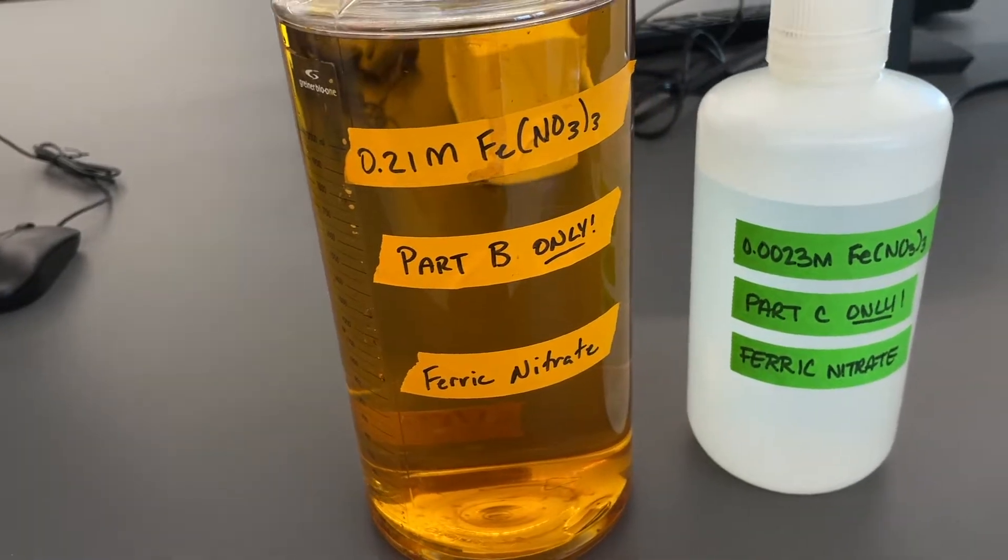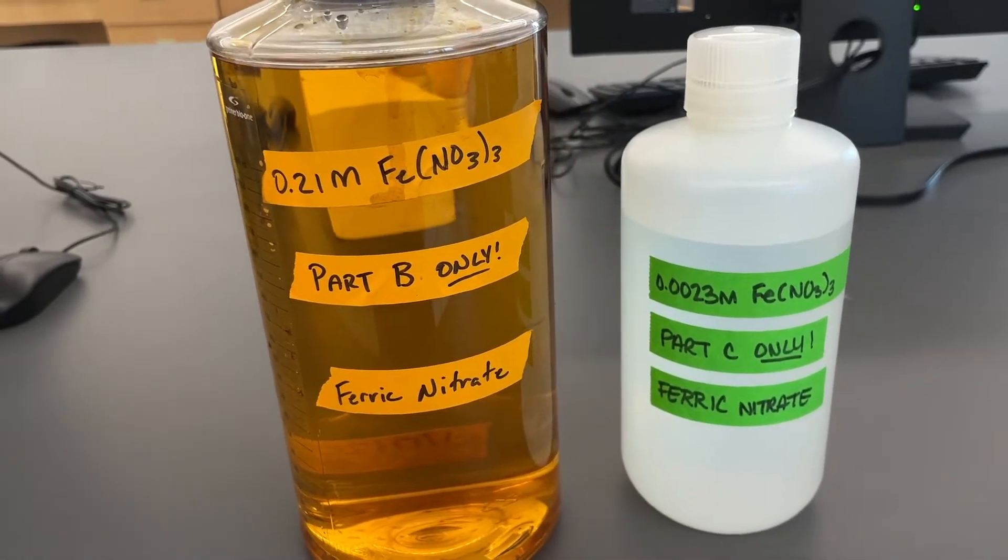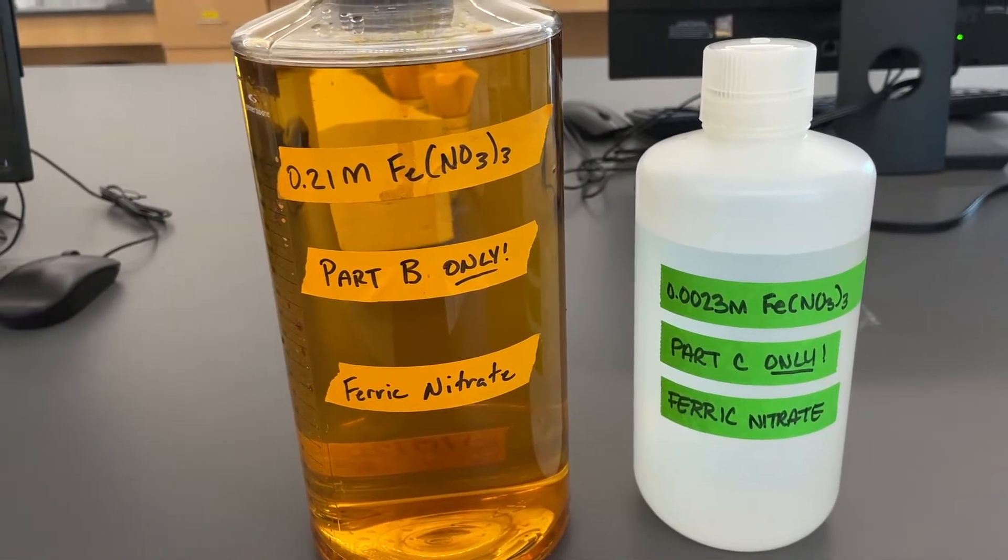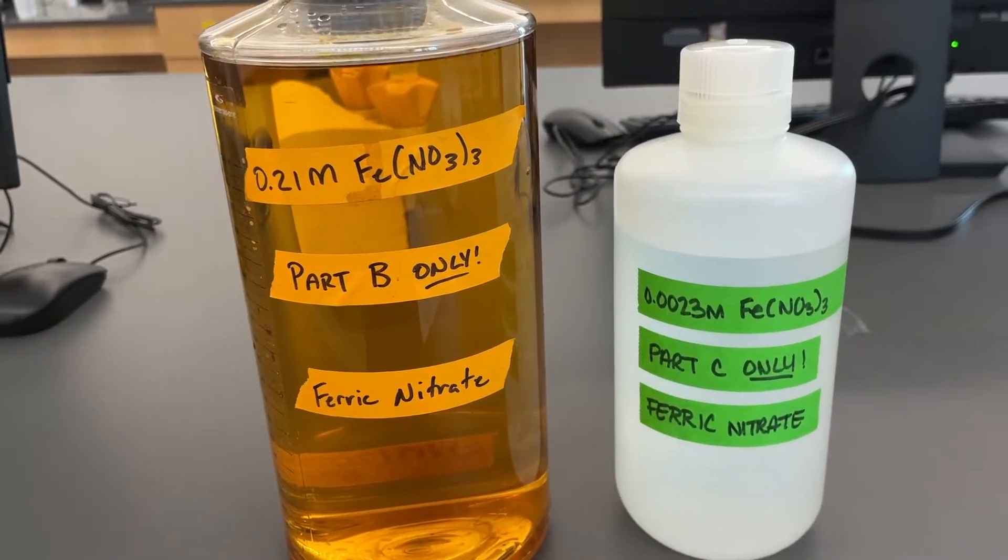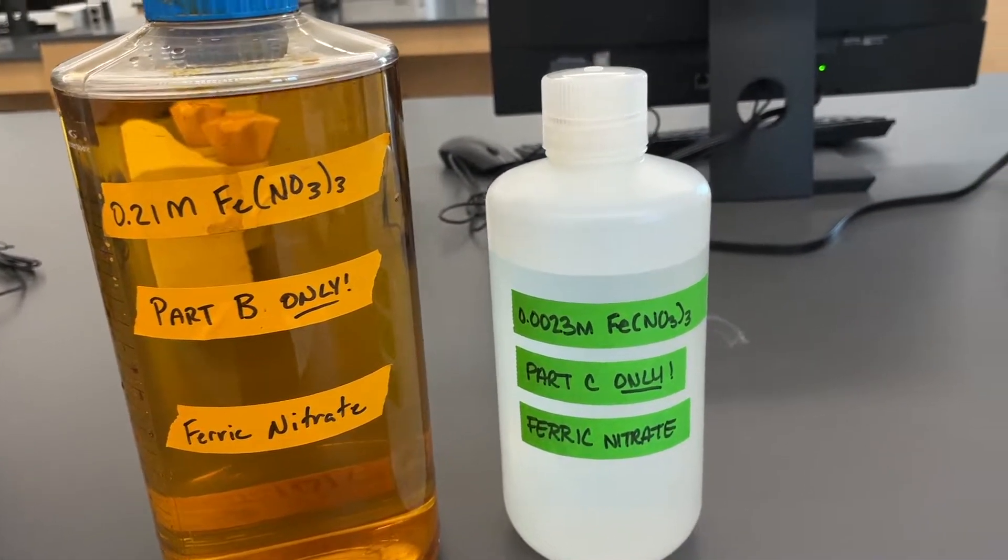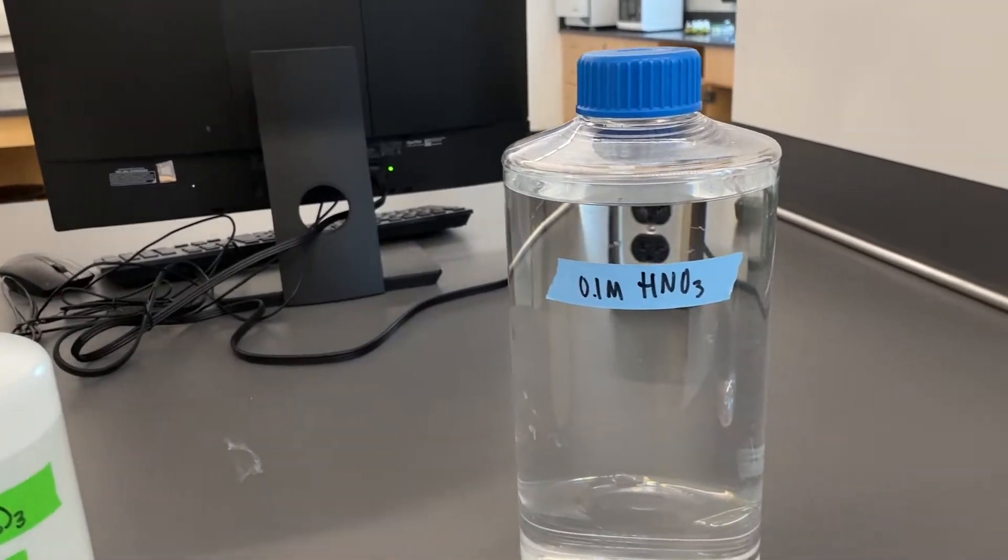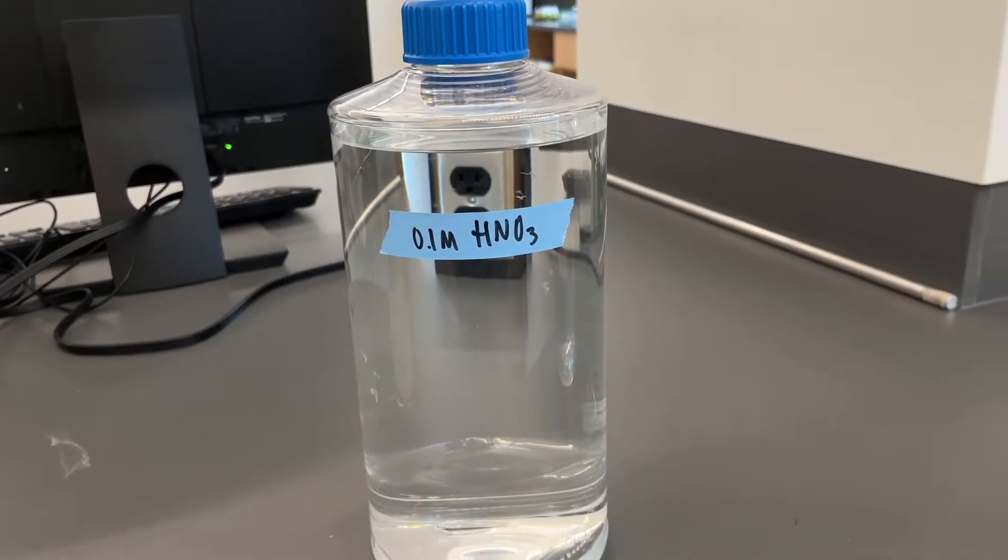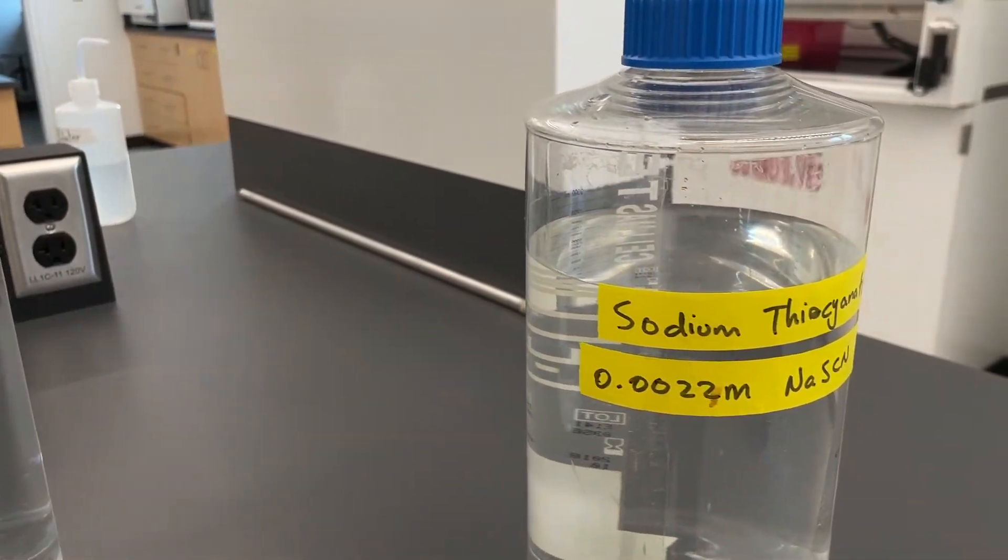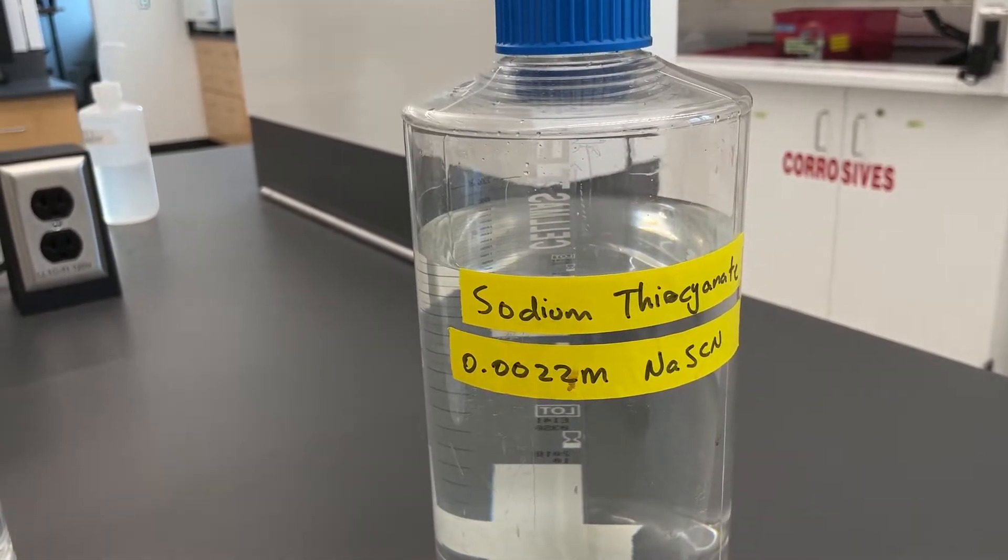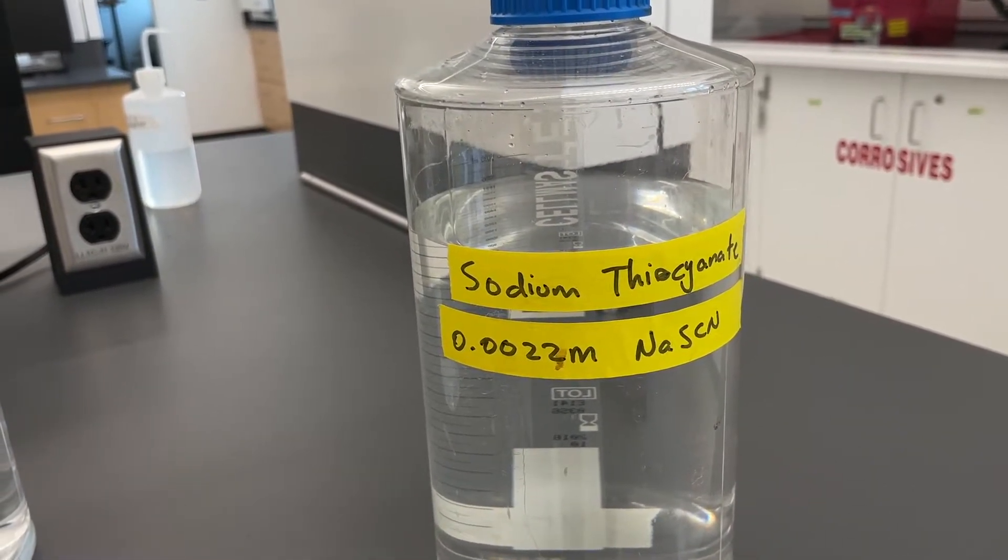To complete this experiment, we'll need several reagents. First we need ferric nitrate at two different concentrations. We have a more concentrated one for Part B and a more dilute one for Part C. We'll need a lot of nitric acid at 0.1 molar and then a fairly dilute sodium thiocyanate solution at 0.0022 molar.